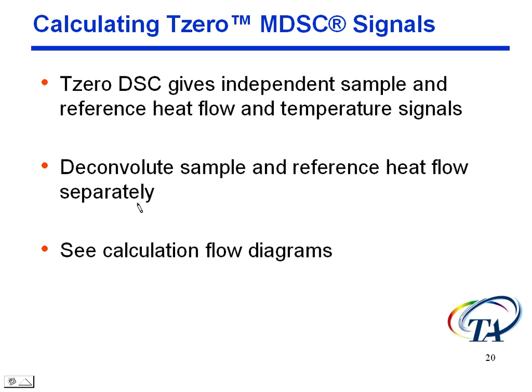With the Q1000, using T4P, we're also using the pan mass and the resistance of the pan as it sits on the sensor and the reaction of the purge gas with that. We can now go down to 20 seconds, or 30 seconds, but we've had good data at 20 seconds before. Those are things we can talk about later.